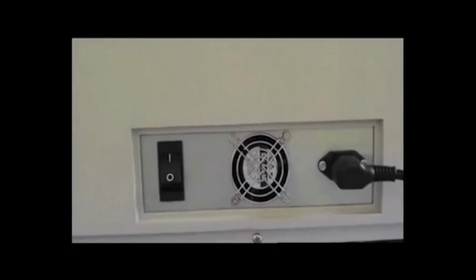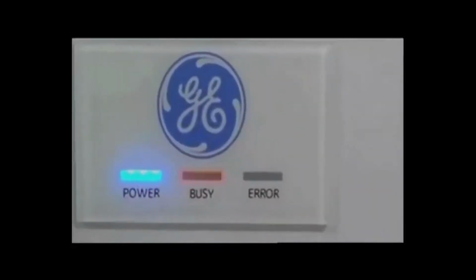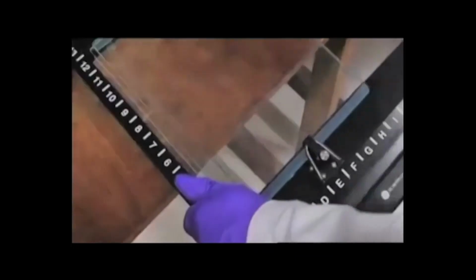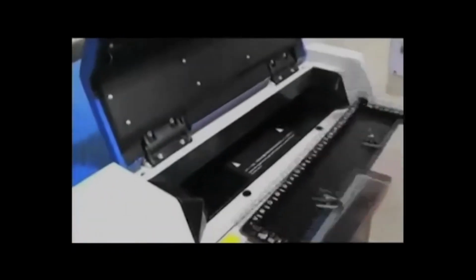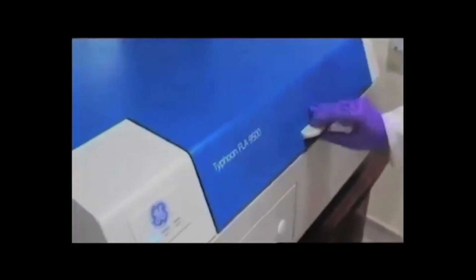Switch on the Typhoon scanner. Place the gel plates on the tray provided as shown and insert it in the Typhoon scanner. Click on the Typhoon FLA 9500 icon.